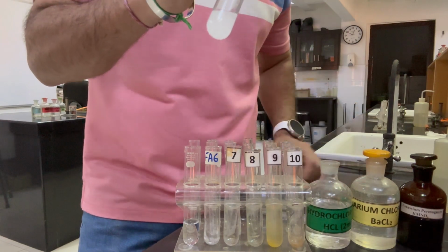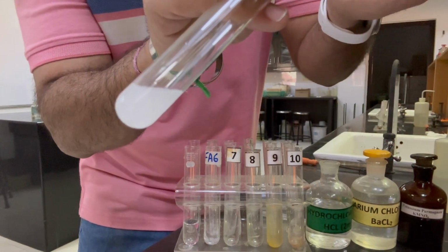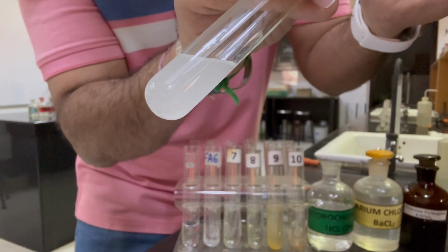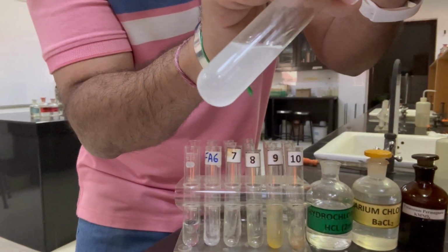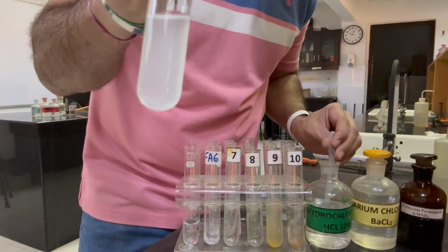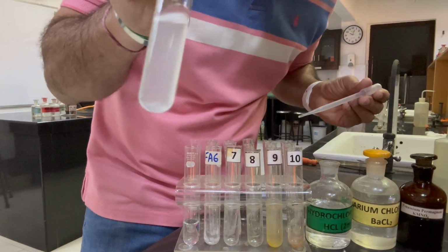Now, if we add hydrochloric acid, I am adding it with a dropper. If I add hydrochloric acid using the dropper, these precipitates are partially dissolving, and if we add a bit more, these precipitates are partially dissolving.